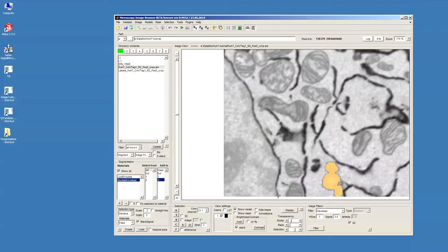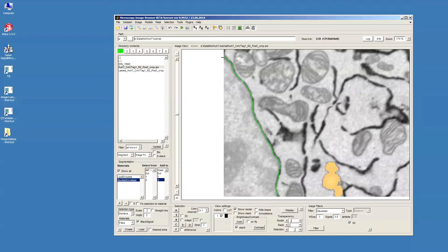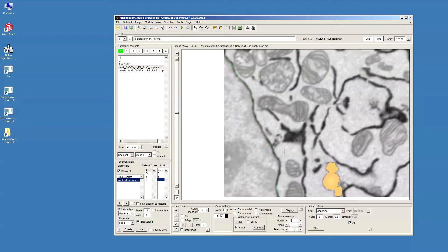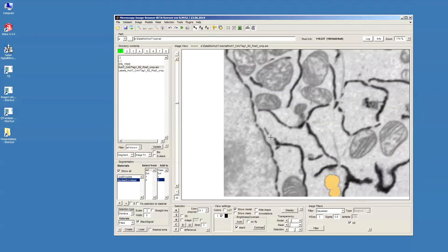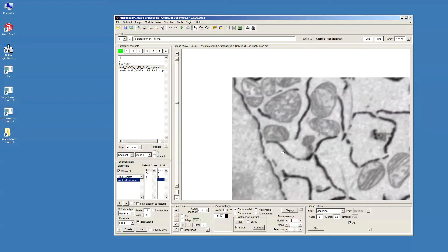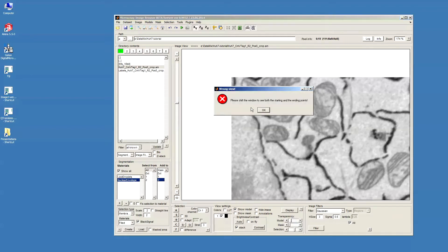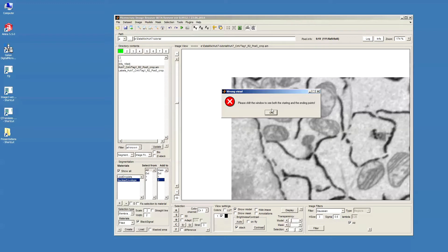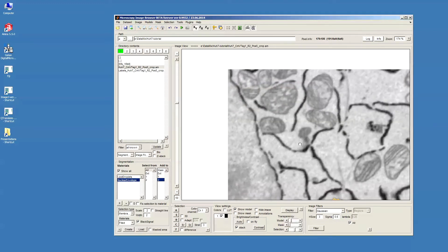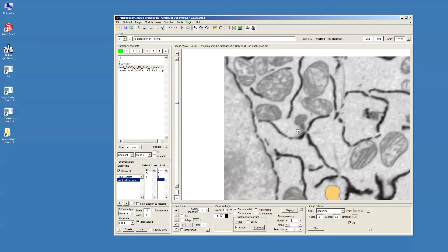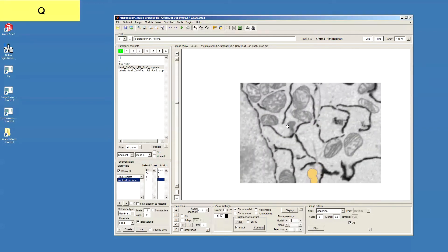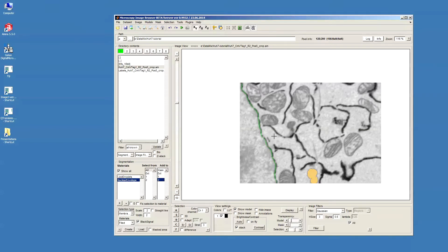We're halfway through. For this tool it's important that the starting point and the ending point on each profile should be at the same slice. For example, now if I put the starting point here and then shift the window so that the starting point actually will be hidden, then the algorithm will say that it's the wrong view. So both starting point should be at the same slice, should be at the same view.